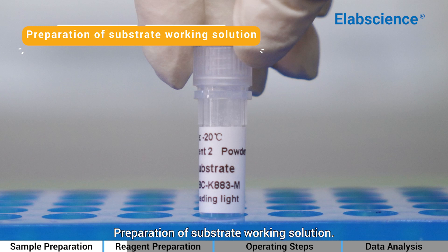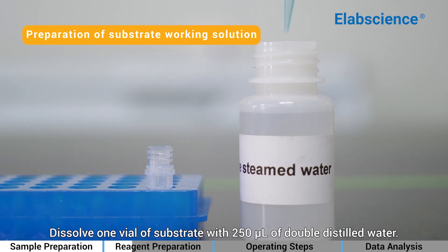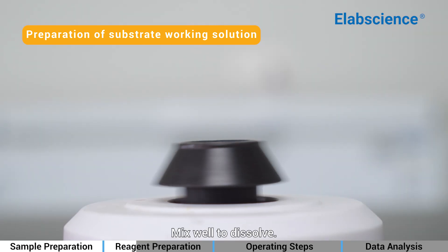Preparation of Substrate Working Solution: Dissolve 1 vial of substrate with 250 µL of double-distilled water. Mix well to dissolve.